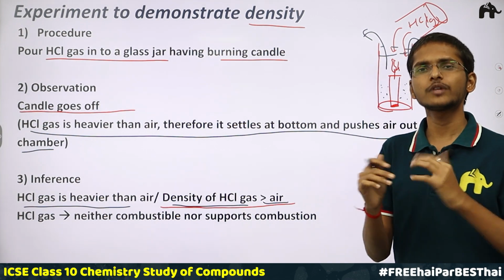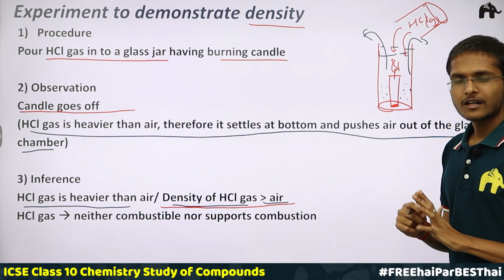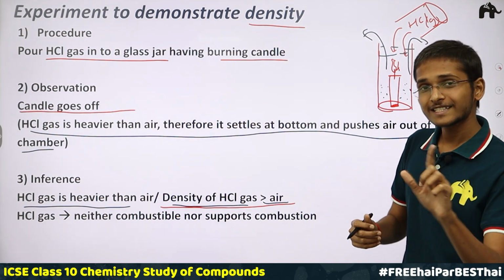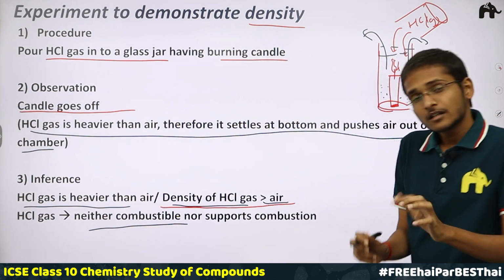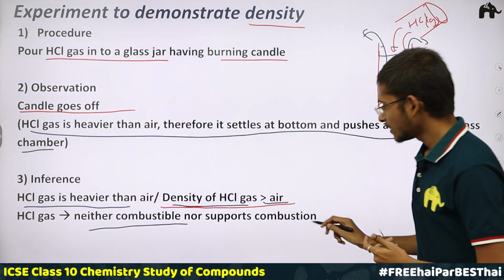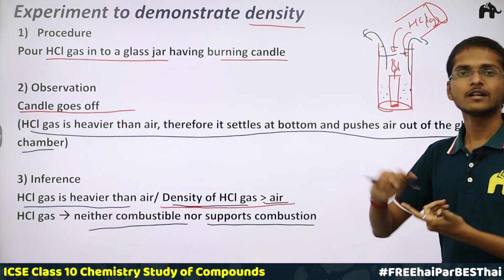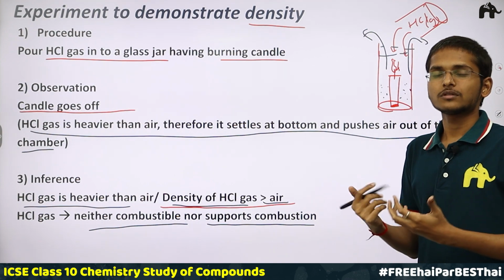Now, one more interesting thing which you can infer from this experiment is, once the jar is full with HCl, our candle is getting extinguished. So this means that HCl is not a combustible gas. We cannot use HCl as a fuel to burn, right? Also, HCl does not support combustion like oxygen, because when HCl gas is there in the jar, our candle is getting extinguished.